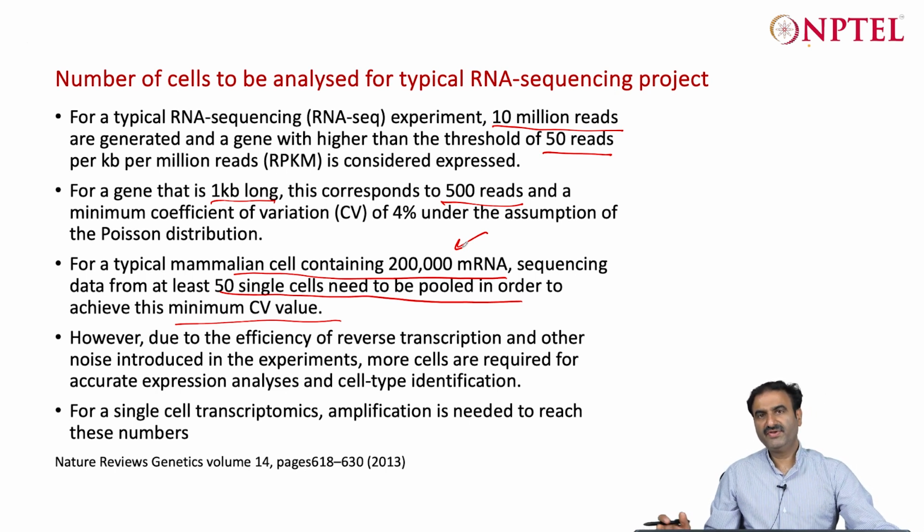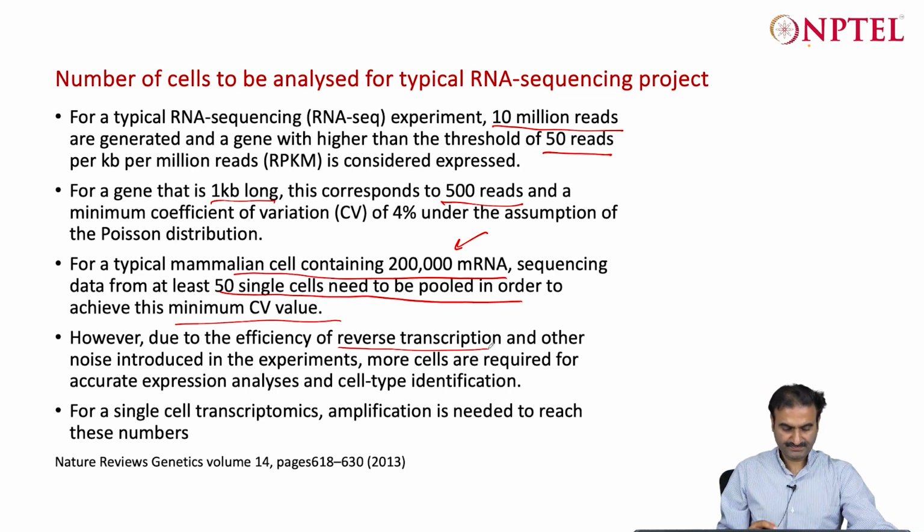And then since you are dealing with mRNA, you have to use reverse transcription to convert that into cDNA, and even in that step you may lose some information about the true number of copies that were present, because it is partly subjective to the reverse transcriptase and chance factor also, but still the overall representation of the different transcripts should be fine, right?